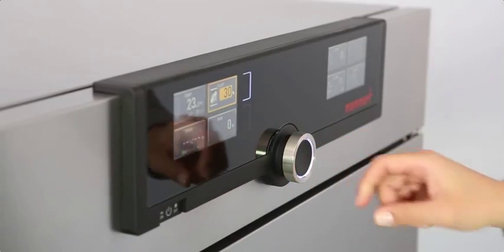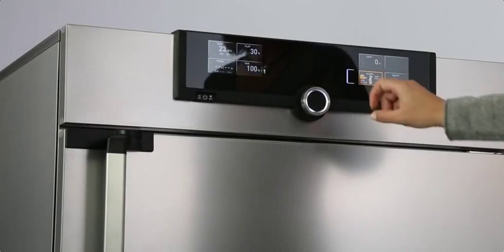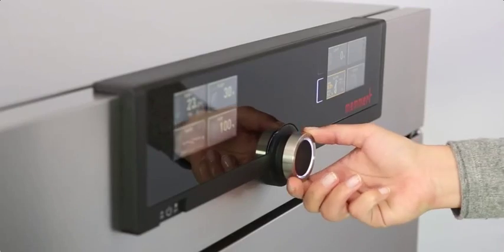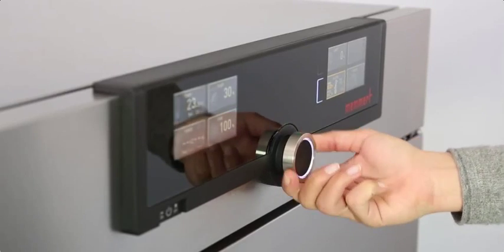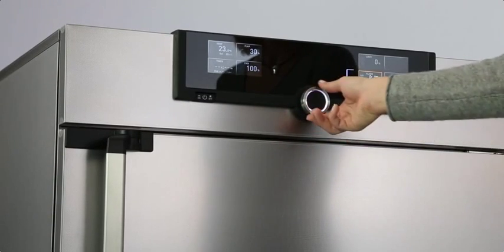Temperature, program duration, fan speed, and ventilation flap positions are all selected in the left display for Generation 2012 appliances. In the right display you can, for example, set temperature monitoring or apply specific parameters such as CO2 and humidity.